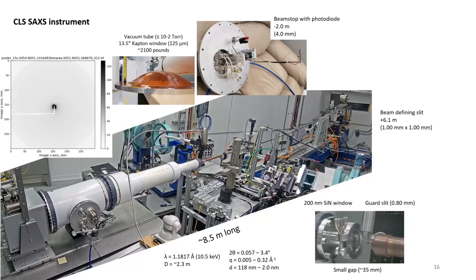So can we use the SAXS to calculate the thickness and the property of the surface layer if the surface layer is amorphous? Well, so you want to know the thickness of an amorphous layer? Sounds like an X-ray reflectivity measurement, maybe. Like the powder material. It's not a thin film, it's a powder. And you're interested in the particles under the film, or I'm not sure I understand totally.